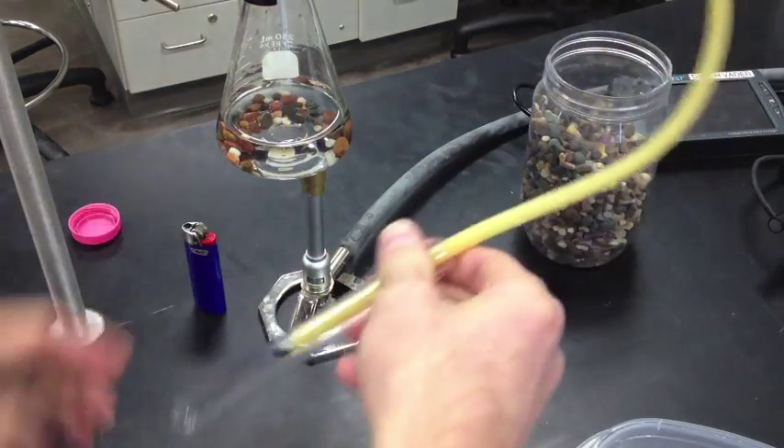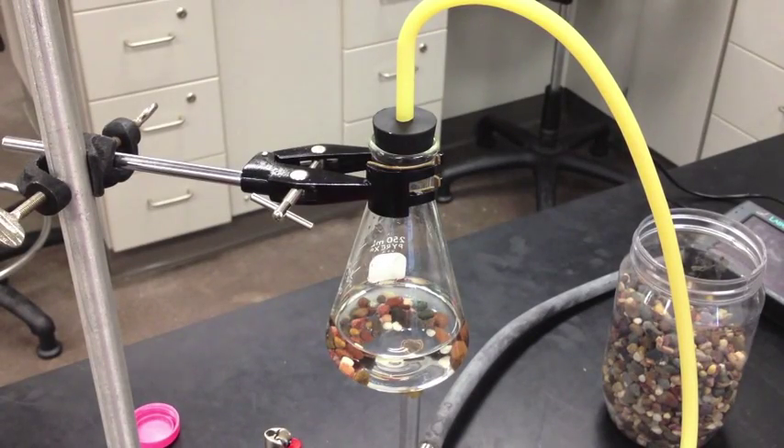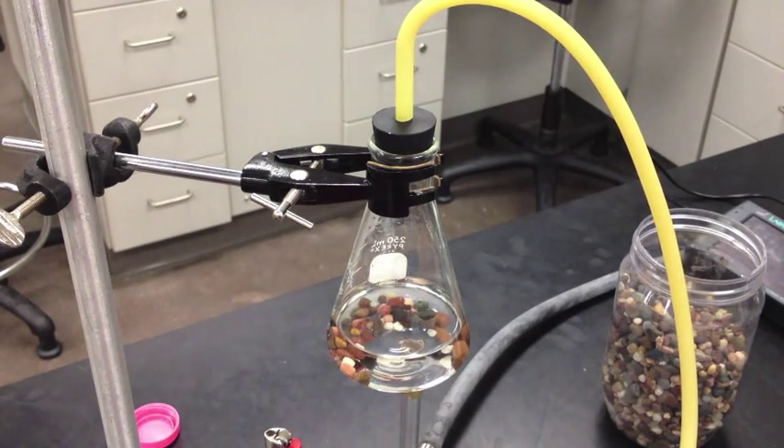Go ahead and put the test tube in the ice water bath. Before you start the experiment, you're going to want to measure how much salt is in the water. I made up the saltwater to contain 8 grams per liter. Now let's use our conductivity probe to measure and see exactly how much is in there.